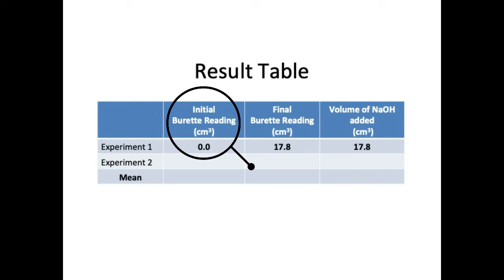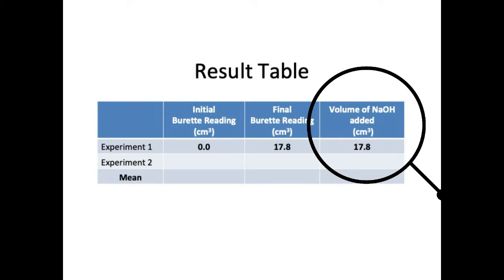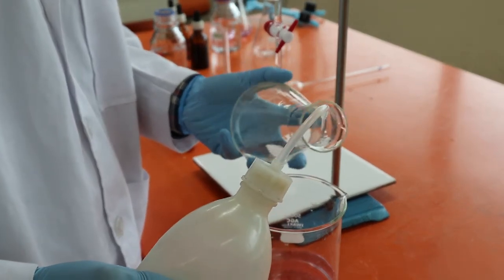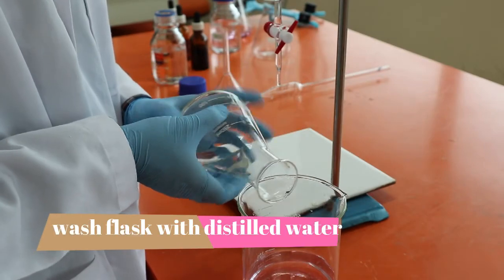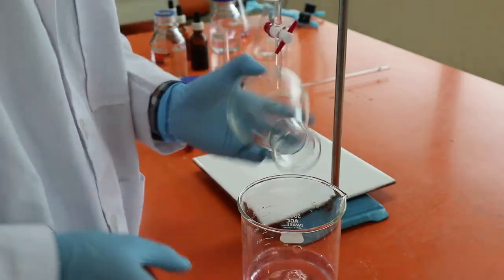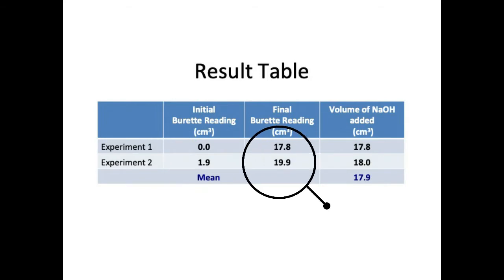When you record your data, it is recommended to do it in a neat table. You must record the initial burette reading, the final burette reading, and the volume of solution added from the experiment. You will repeat this experiment as many times as needed using the same procedure and add the results to your recording table. If you have to use the same conical flask, always rinse it with distilled water before you start. You don't have to always start from the 0.0 mark — I start from 1.9 and proceed with the same procedure.